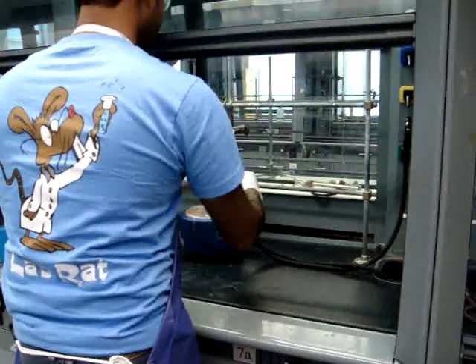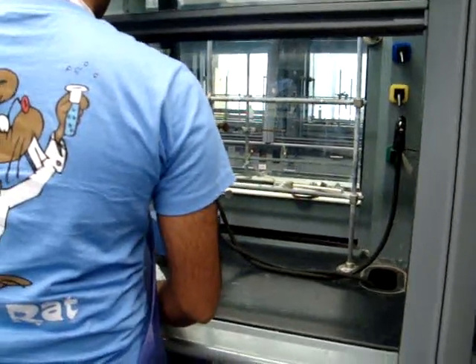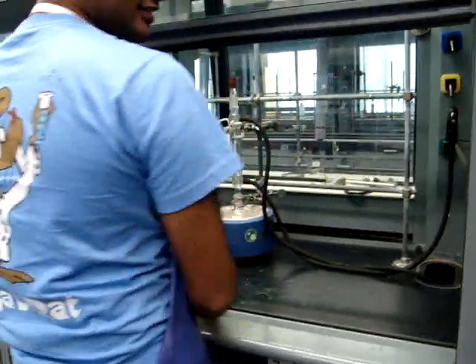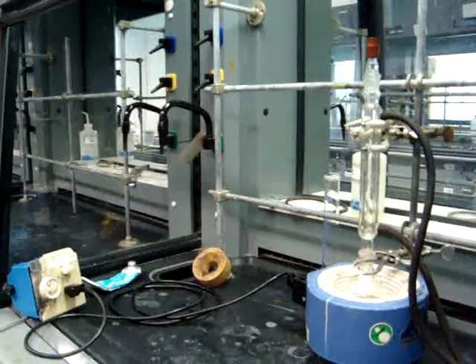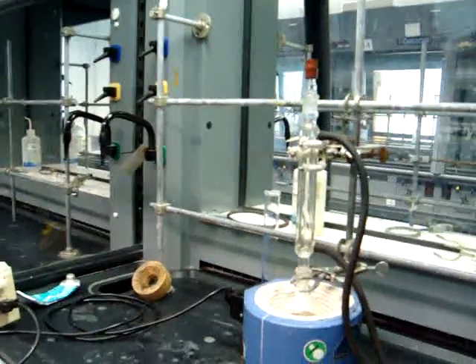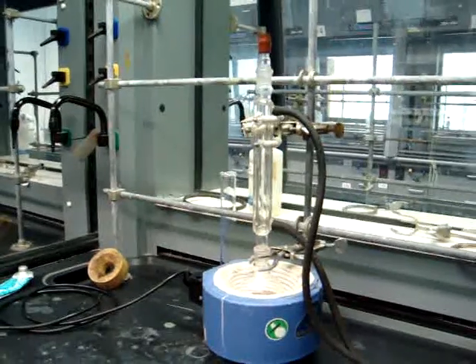You will then use vacuum filtration to filter out your solid, as you have done in previous labs. Once you have retrieved your solid, you will weigh it and calculate the percent yield.